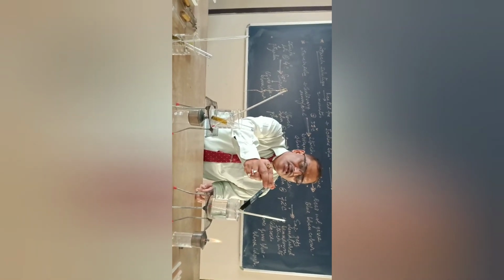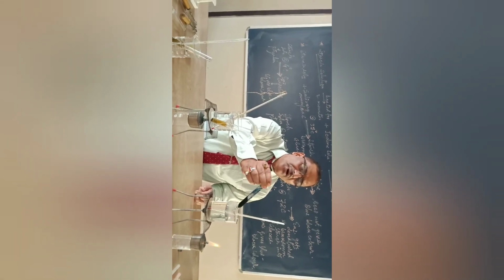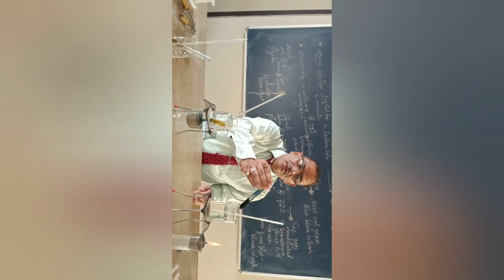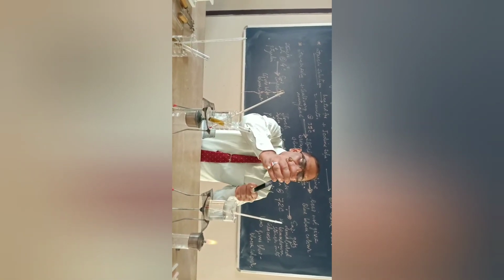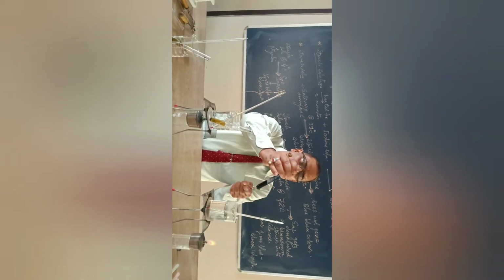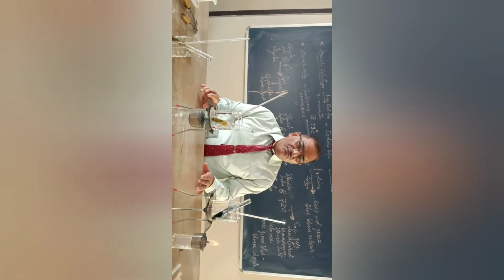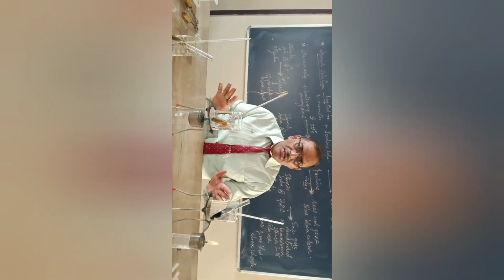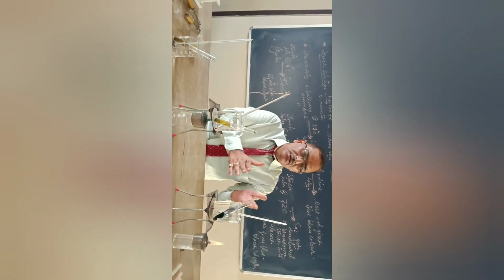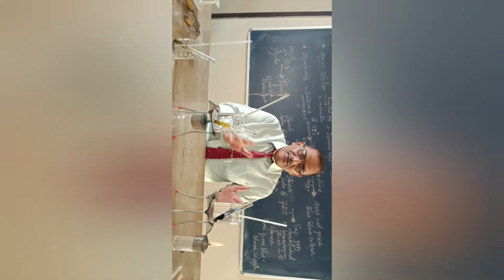In this case, there is no activity of enzyme. At very high temperature, the enzyme gets denatured, so the enzyme activity stops, and that's why the enzyme could not break starch into glucose, and that's why you are getting the clear blue black color due to the presence of starch. So this is the experiment. We have discussed the activity of enzyme at different temperatures, around 4 degrees Celsius, around 37 degrees Celsius, and around 70 to 80 degrees Celsius. Enzymes get denatured.